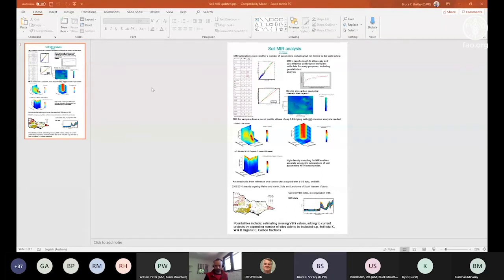It's all the standard sort of things there, I guess. As was pointed out earlier, SCART was the source of our data for our carbon and carbon fractions. We use that a lot. Similarly, PSA gets used or requested a lot. We are currently working on field capacity and wilting point.